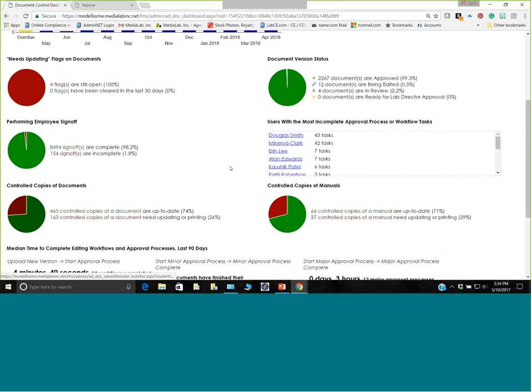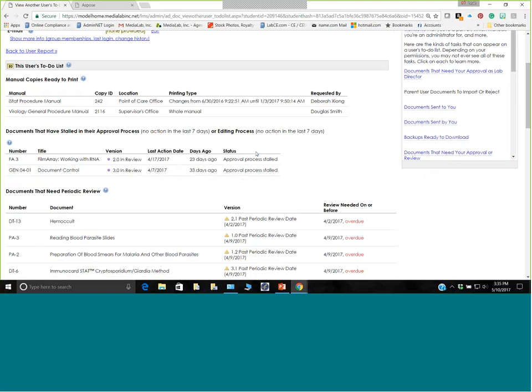Over here, I can see my administrators and the to-do lists and tasks that they have sitting on their to-do lists. So it does kind of keep you honest. There's transparency here. You can see one another's to-do lists as admins. Maybe find out who should be asking for PTO and who shouldn't. So it's great. You can click and see the to-do list of your other admins in the system as well. If you're wondering about a particular document or the status of something, you can check out that.